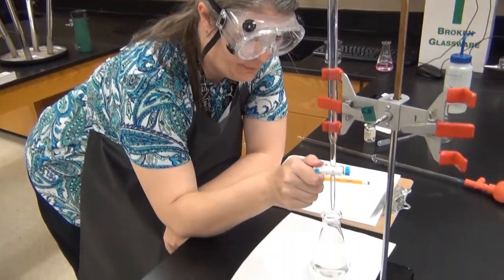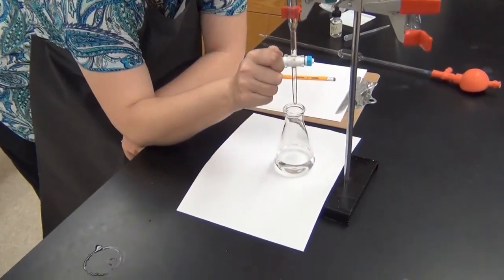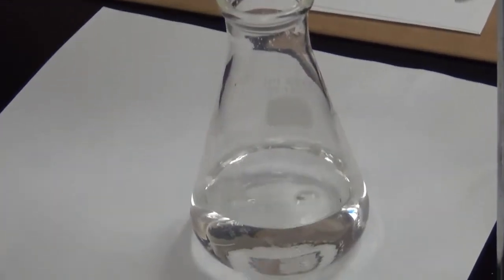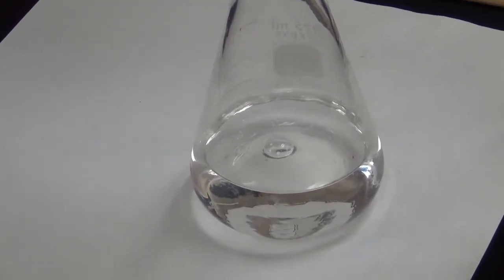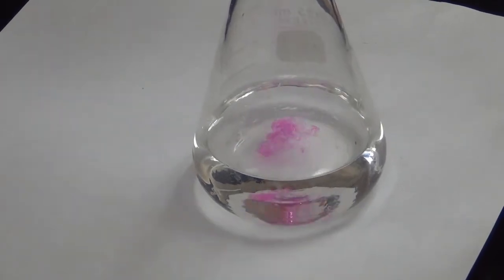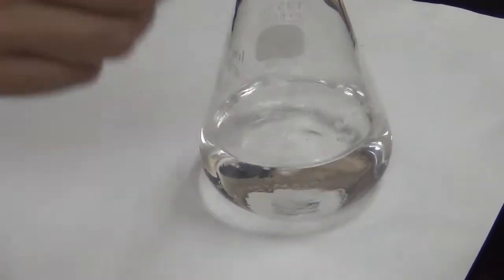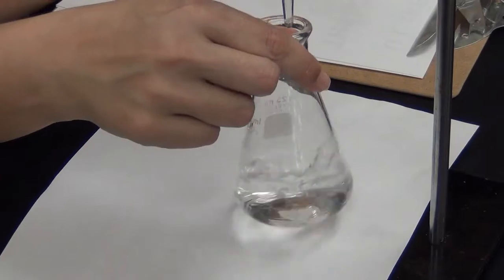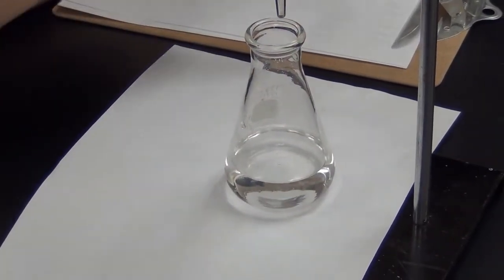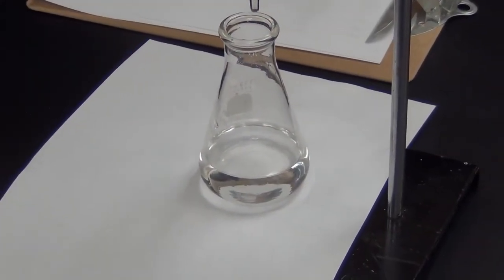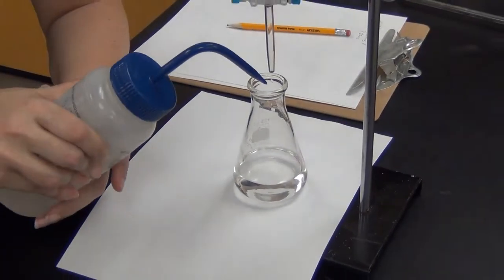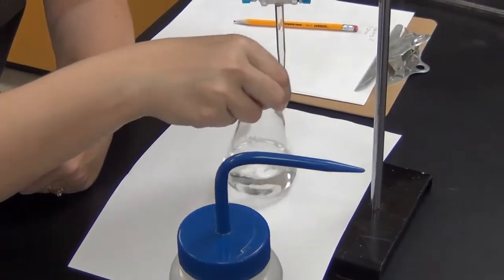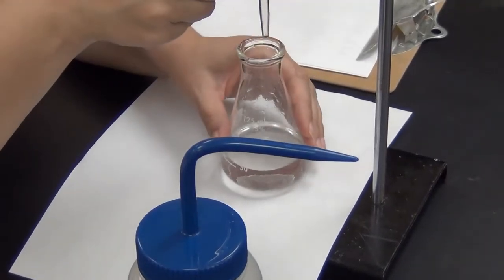Getting close to where I expect this might be, and you can see I'm adding small amounts and swirling, and the color change is starting to be fairly persistent. So I know I'm getting close to the end point, and I need to add small amounts at a time until I get that persistent light pink color again. And I want to be looking and watching for any droplets like that that are going down the glass, and I want to make sure I wash them into the solution so that that base gets in and reacts instead of being stuck to the glass.